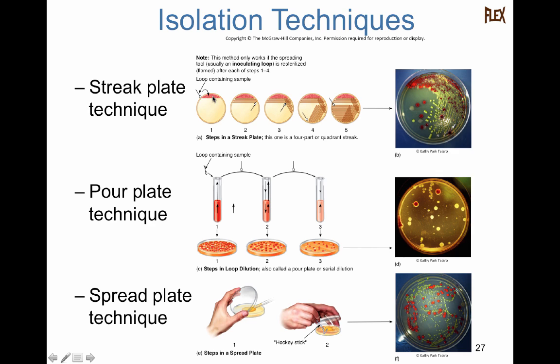So you have a little bit of bacteria here, but you don't have colonies yet. So what you're going to do is take a sterile stick or a sterile rod, and sweep and drag some of the bacteria in a few lines, okay, in a motion from this side of the plate to another area of the plate. Then you're going to take this stick and throw it out. Grab a new sterile stick, and drag cells from the edge of this bacteria to another area of the plate. Then throw that sterile stick out and do it again. From this end, you're going to drag bacteria.